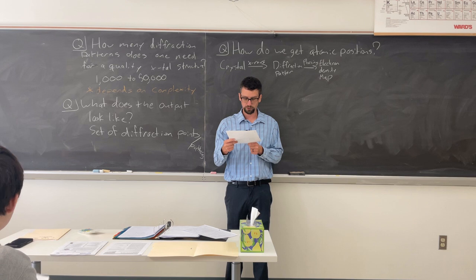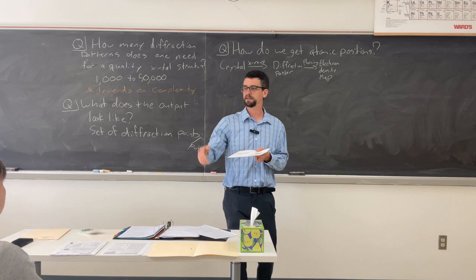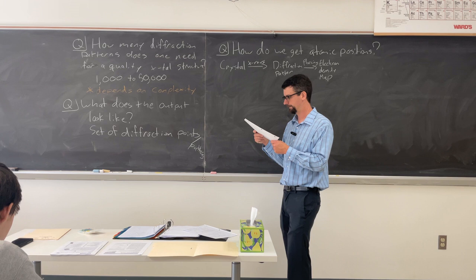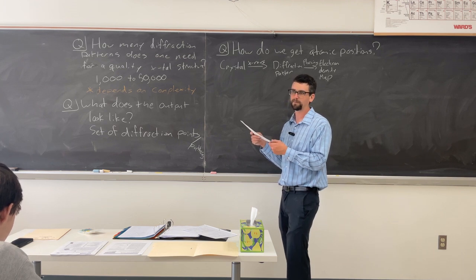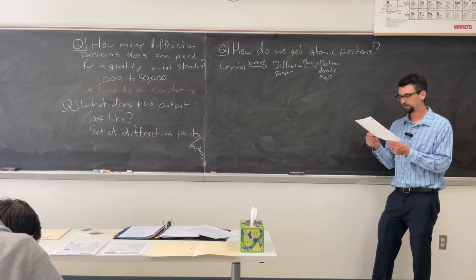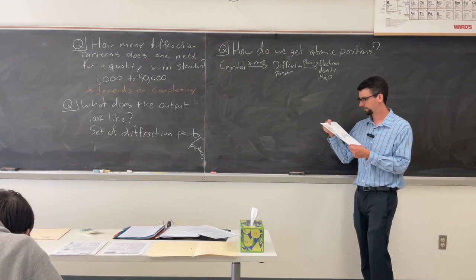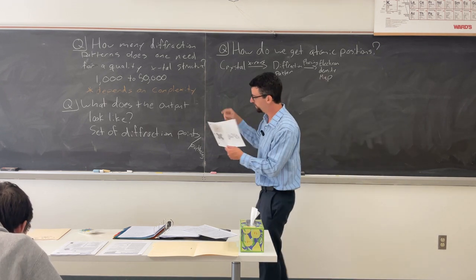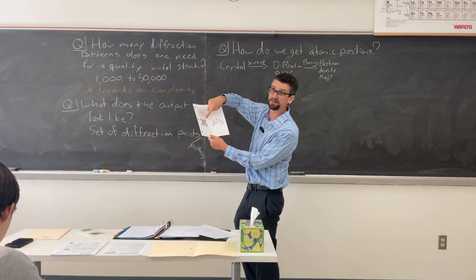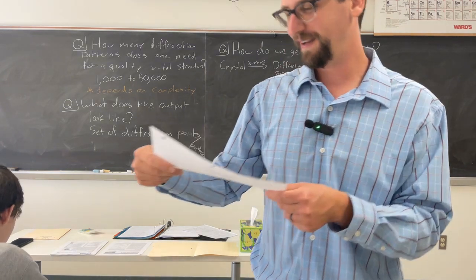This is the actual true output of what we see. These are the diffraction patterns. This is a contour map that's been sliced in half. Anybody know what this molecule is? Semi-biological in nature. Where is there a lot of electron density? Given it's in the center, yeah. What do those edges look like to you? Benzene, yep, they're phenyl rings.